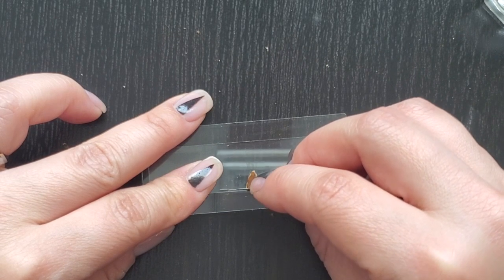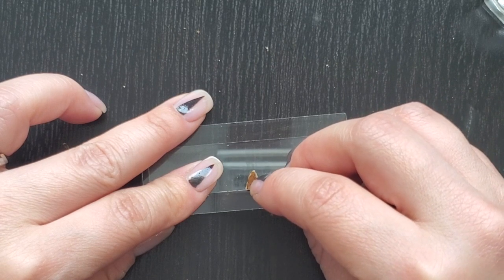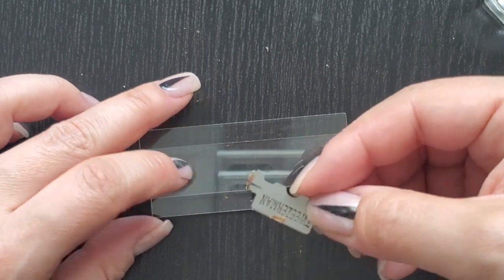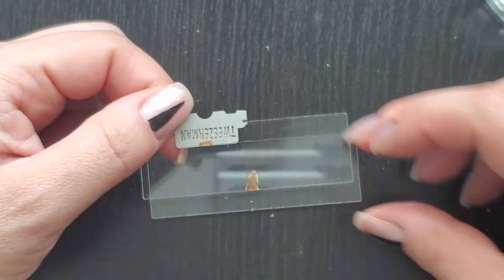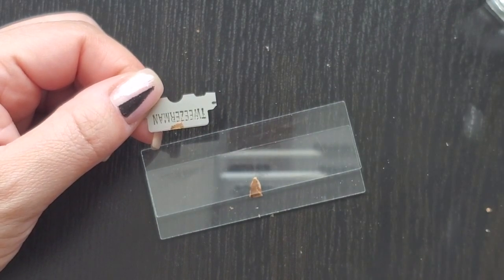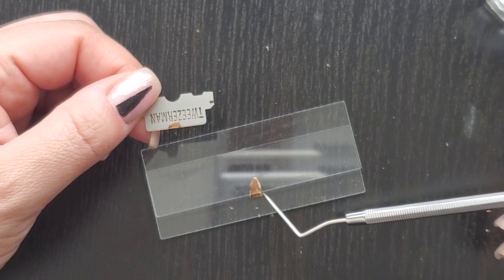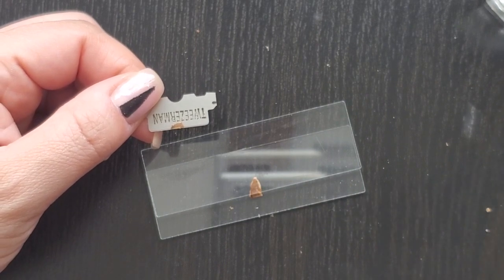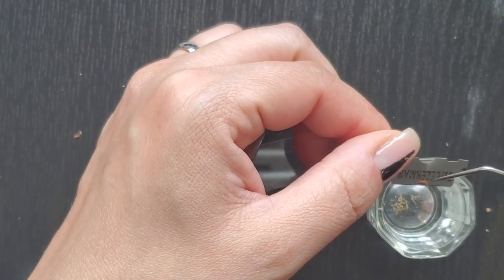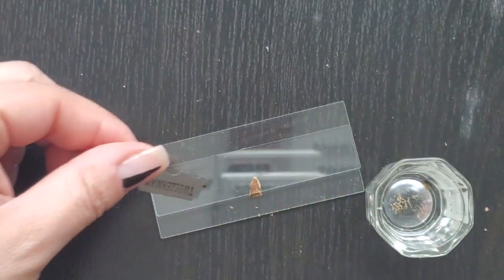One way to challenge yourself to get smaller sections is just think of it as, how many sections can I get with this little piece that's sticking out from the glass? The more you can get means you're probably getting thinner and thinner and thinner sections. So let's say that I move this lid, the top here. So your challenge is to get as many slices from here until you hit the glass. So can you get 10? And that's one way of thinking. Instead of getting nervous about how many or how thin they are, just try to get really a large number of sections in that little piece.